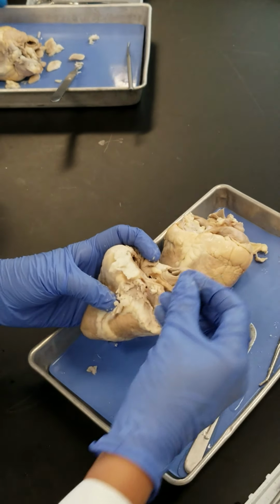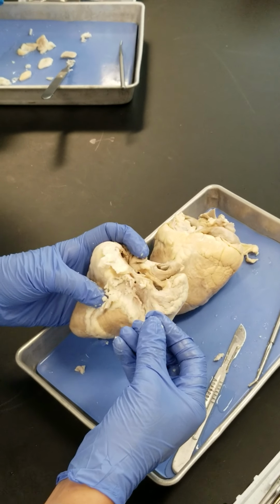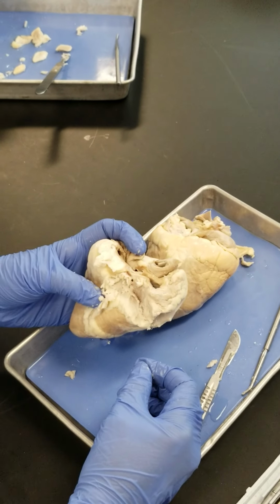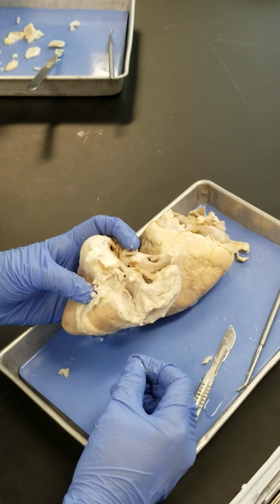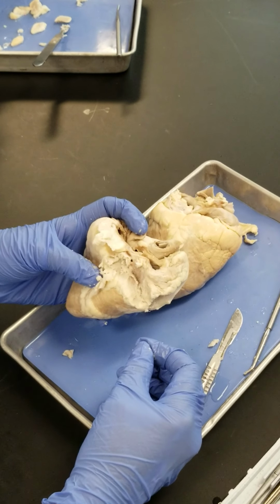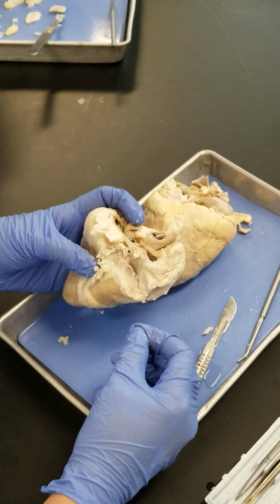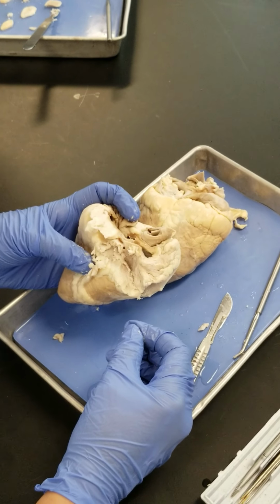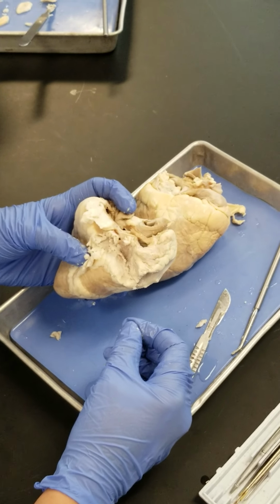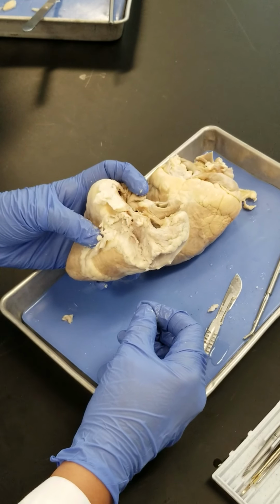How many vessels are going to the left atrium? Two? One? What about three or four? I would say four. It's two from each side, so it will become four. So we have four vessels going toward the left atrium.